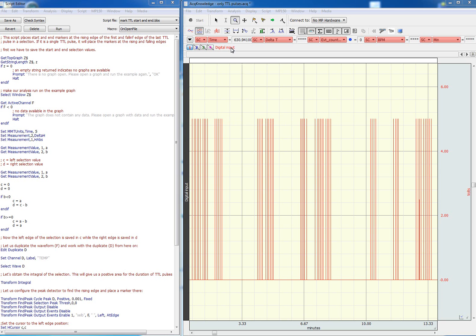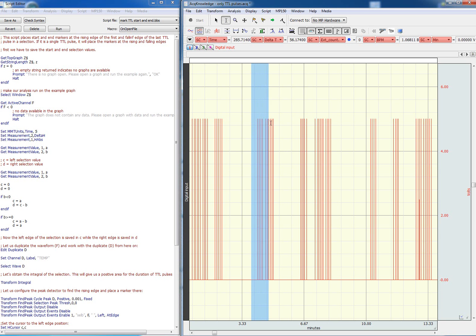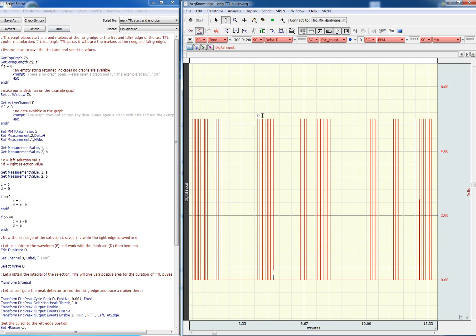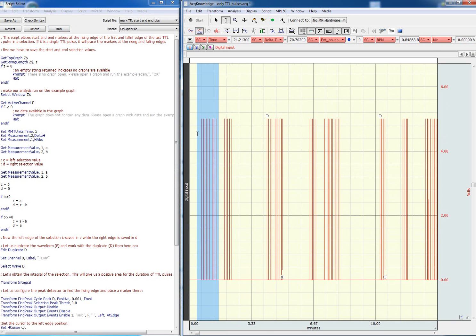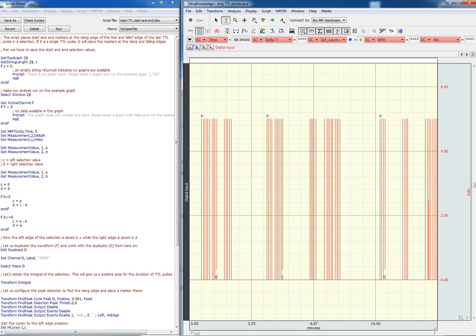We just have to go ahead and select one burst of pulses, hit run, and we have the beginning and end selection markers. We can repeat this process and mark additional bursts of pulses. Afterwards, we can use additional scripts to perform measurements on the selected intervals.